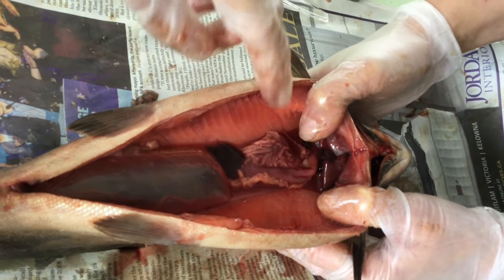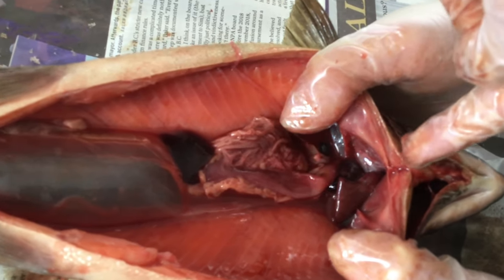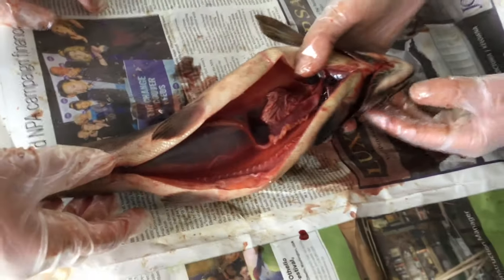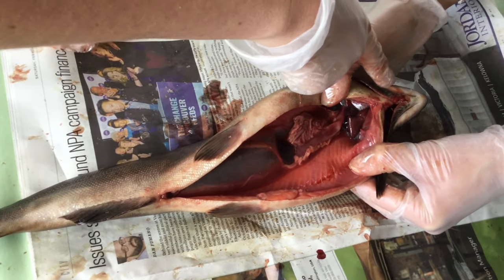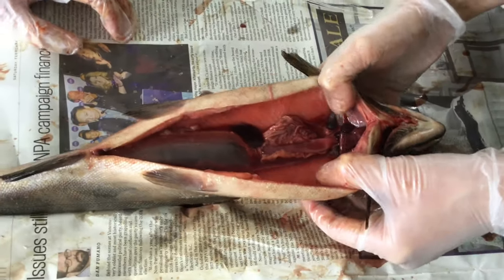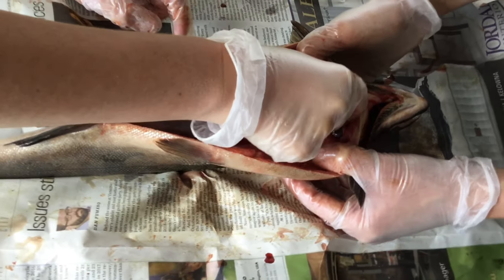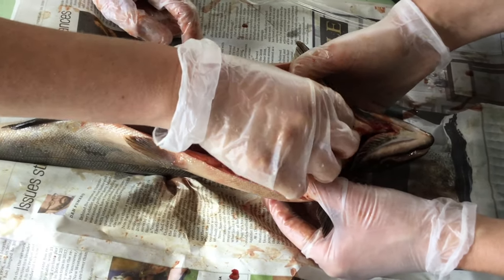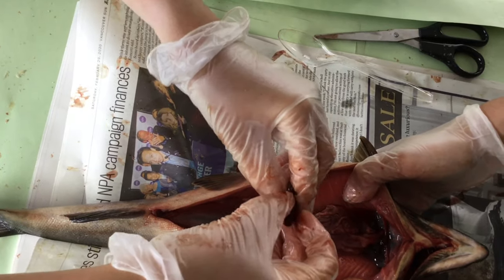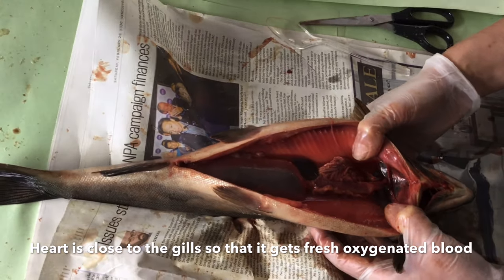Now, Miss Anima or Miss Alicia, can you point to where the salmon's heart is located in its body? As you can see, it's very close to the head. If this was on us, it would be like near our mouth. Of course, there is a reason for the salmon's heart to be near the head, because it has to be near the gills. The gills are what salmon use to absorb oxygen, so they have to be very close to the heart, whereas in humans, it is our lungs that need to be close to the heart for the same reason, getting the oxygen.